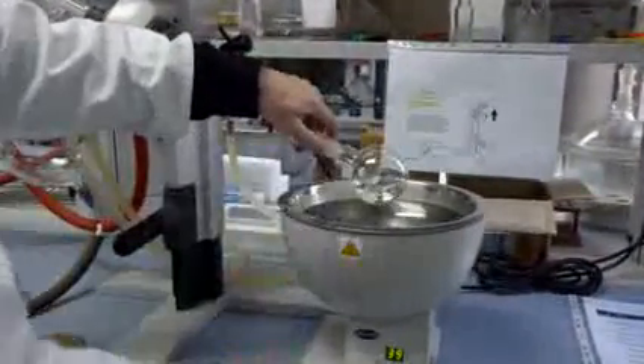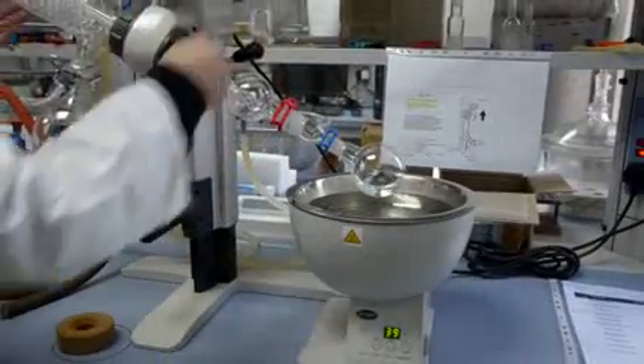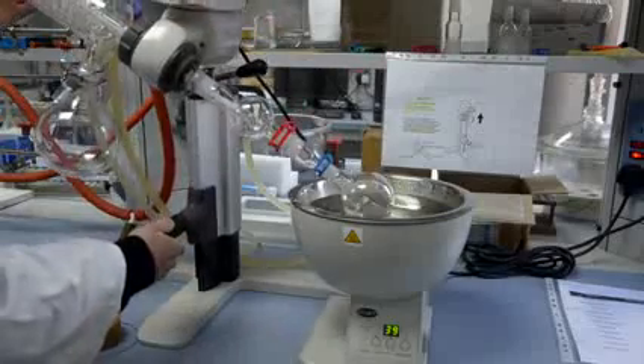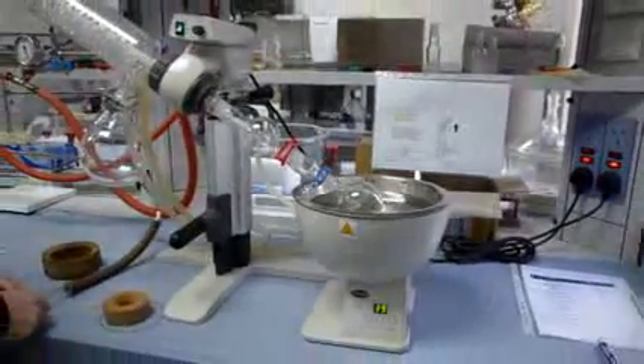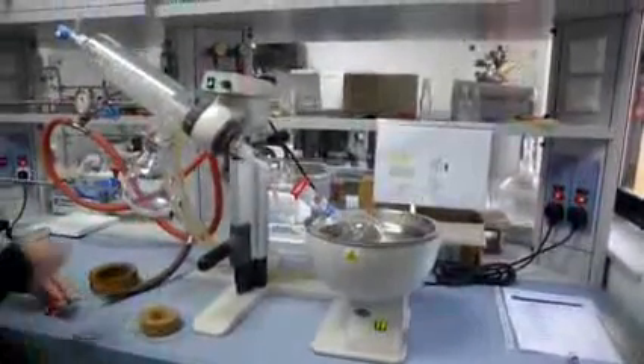Connect your flask, clamp it, and ensure the angle and height of the rotary evaporator are sufficient to immerse the flask effectively within the water bath. Open the vacuum valve completely and turn on the vacuum line from the tap.